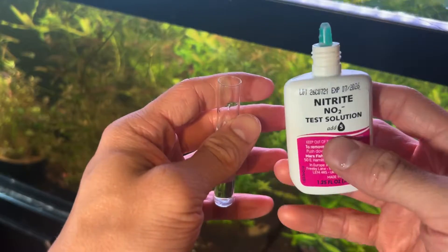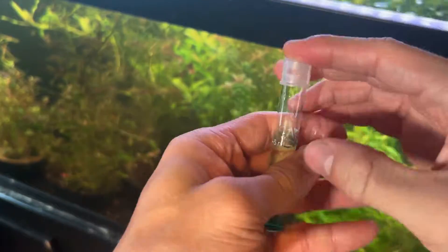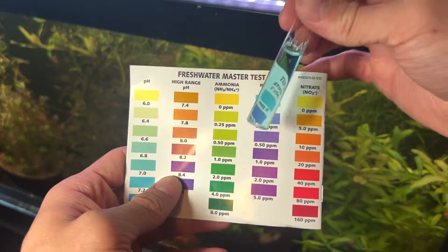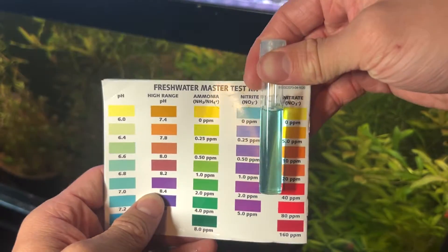Next, let's test our nitrites. Add just five drops of the nitrite solution, shake it up, and let's do our reading. It shows we have zero, which is a great score — the goal for nitrite levels is to be at zero. If you have any nitrites, I recommend doing a water change.